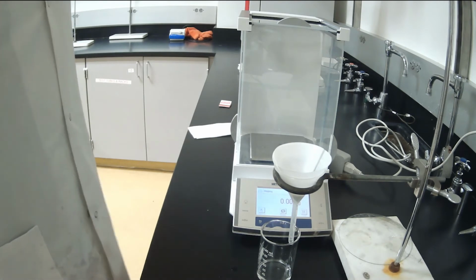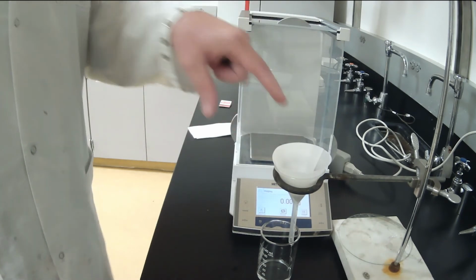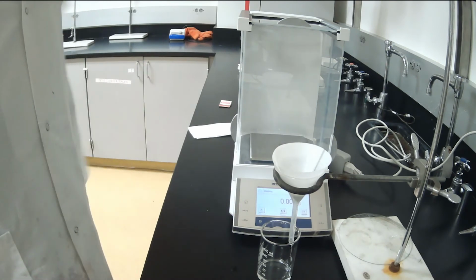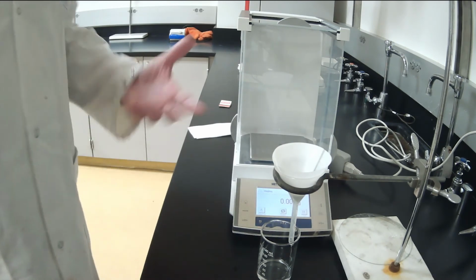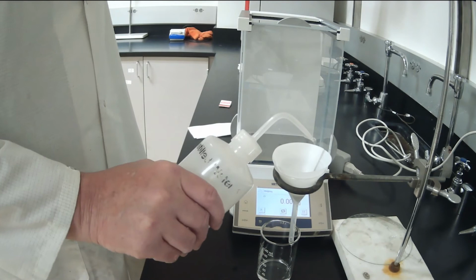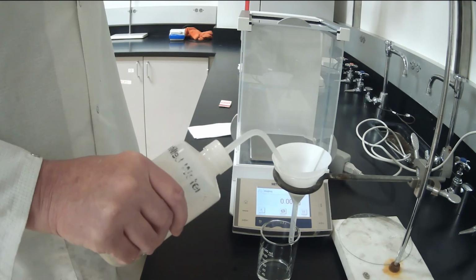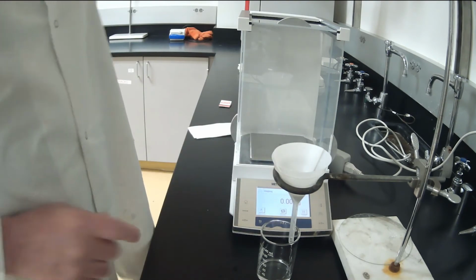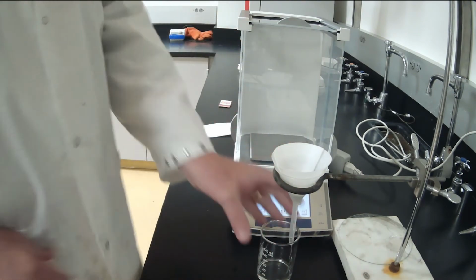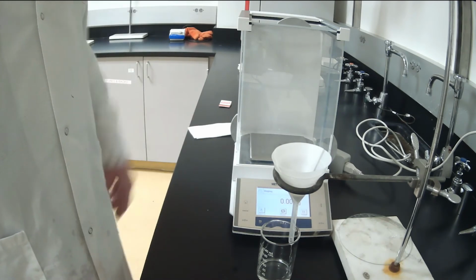washes. A wash step is basically a step where we try to rinse and purify whatever solid we're collecting and rinse out any of the soluble ions and other compounds. In this case, we're going to try to rinse out any soluble sodium chloride. To do a complete rinse, you take your pure water and you squirt the very top edge of your filter paper, just gently, one time all the way around. And as you squirt the top edge, the fresh water should push any salts down towards our filtrate on the bottom. And we let that settle, or drain, in other words.